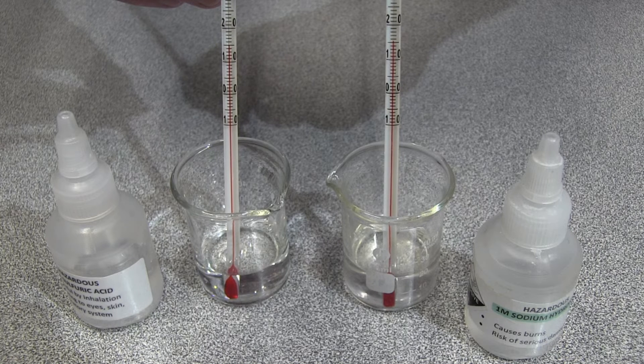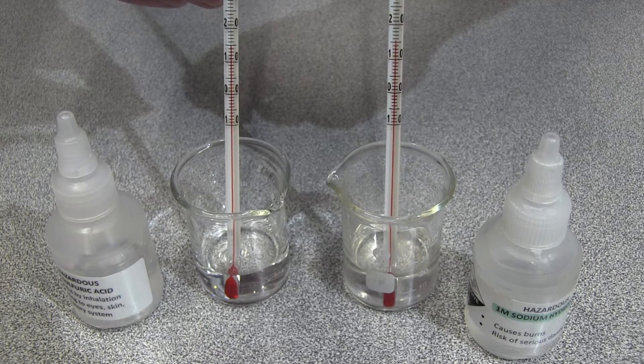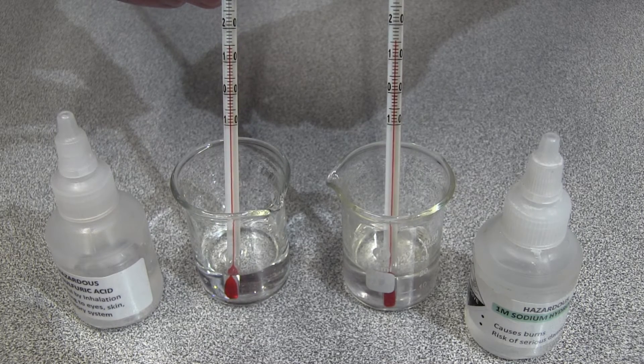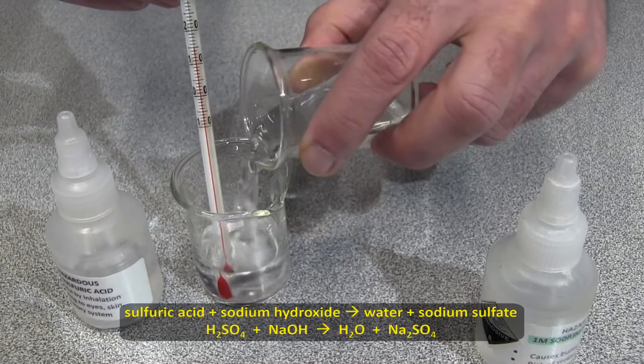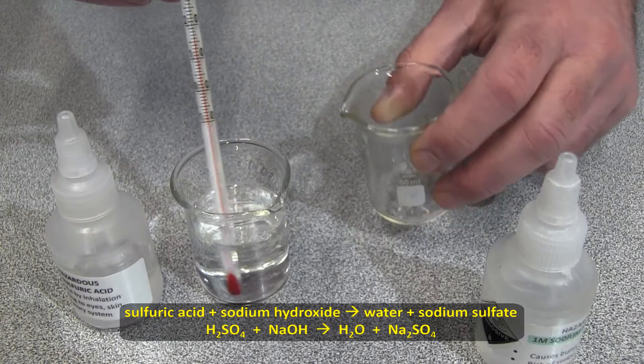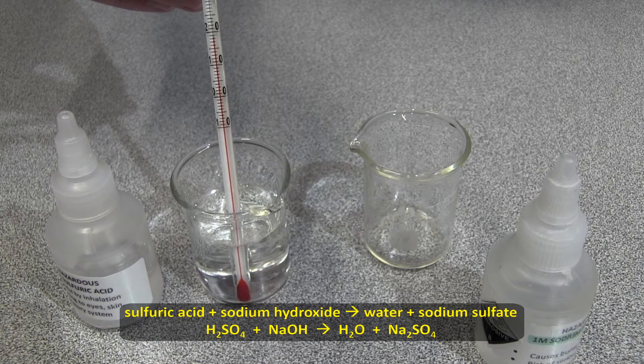Now, when a neutralization reaction occurs, it's not always obvious, but heat is always generated. The sulfuric acid and the sodium hydroxide here are both about 15 degrees Celsius, but when I mix them, a chemical reaction takes place which produces water and sodium sulfate. And the temperature quickly rises to about 20 degrees Celsius.